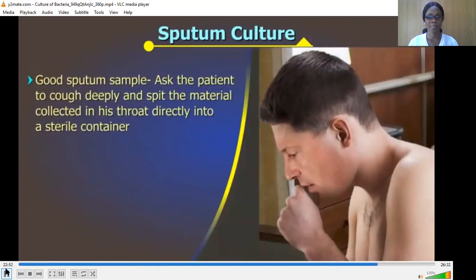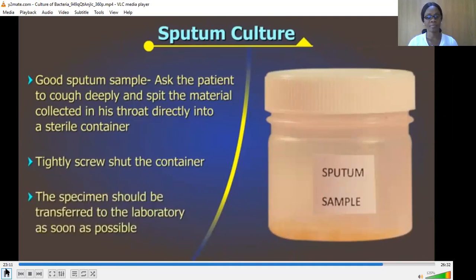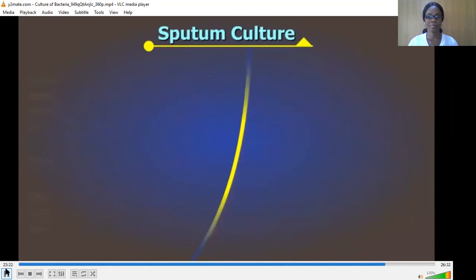For a good sputum sample, ask the patient to cough deeply and spit the material collected in his throat directly into a sterile container. Tightly screw shut the container and wipe off any spilled material with a tissue moistened with disinfectant. The specimen should be transferred to the laboratory as soon as possible, preferably within 2 hours, as delicate pathogens may not survive for long.